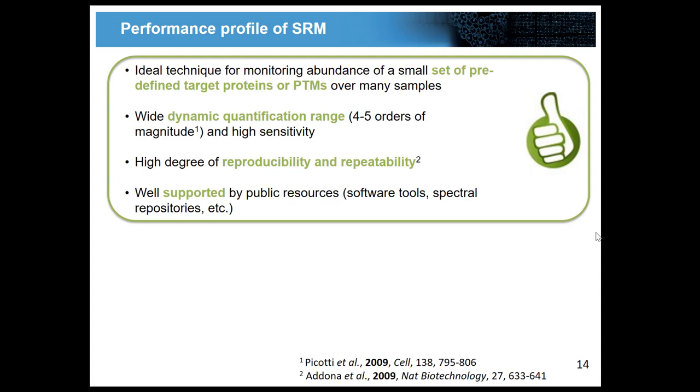Okay, so to wrap up this part, once more about how SRM works. Here are once more the performance advantages of SRM. SRM is the ideal technique for you if you want to monitor concentrations of a rather small set of predefined target proteins or PTMs that are of interest for your project.